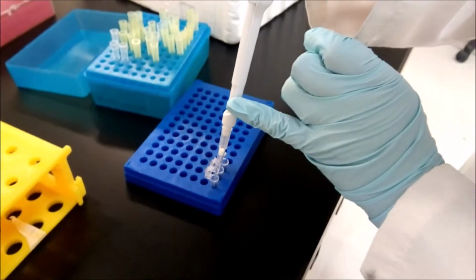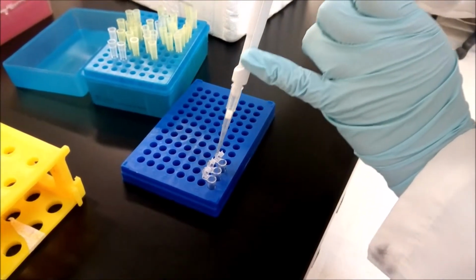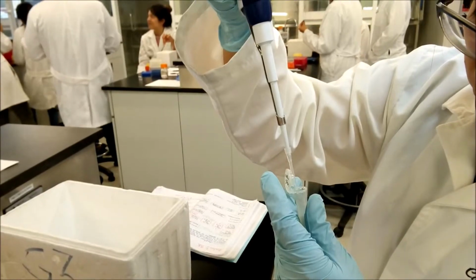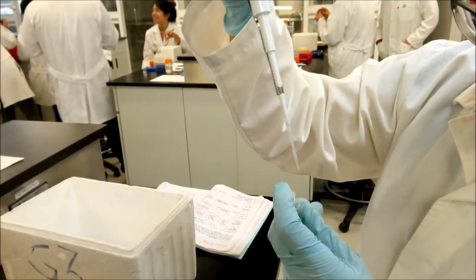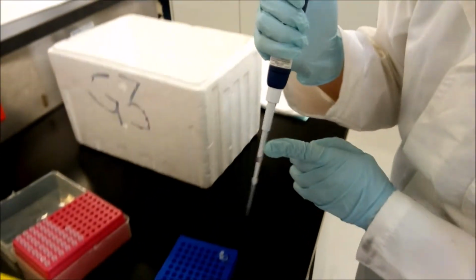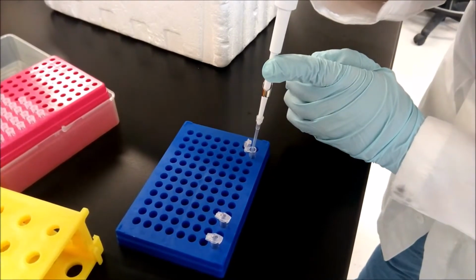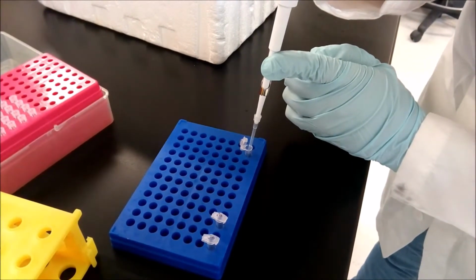Divide the master mix into 3 aliquots to obtain a positive control, a negative control, and that of the sample to be analyzed. Add 2 microliters of molecular biology water to the microtube that will contain the negative control. It must be molecular biology grade to avoid contamination and amplification of non-specific fragments.